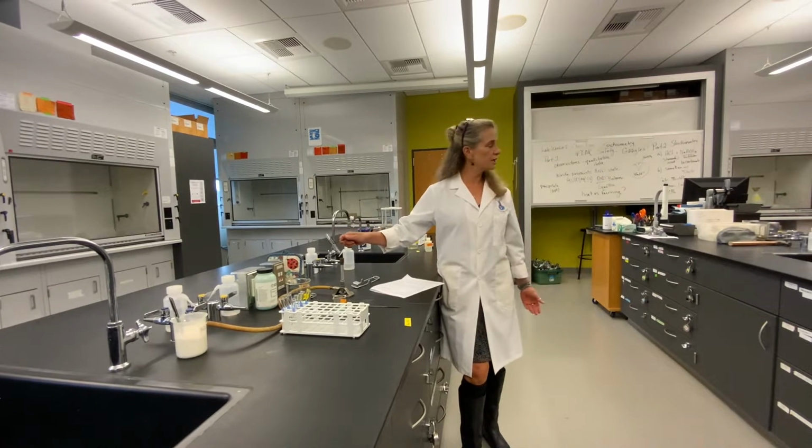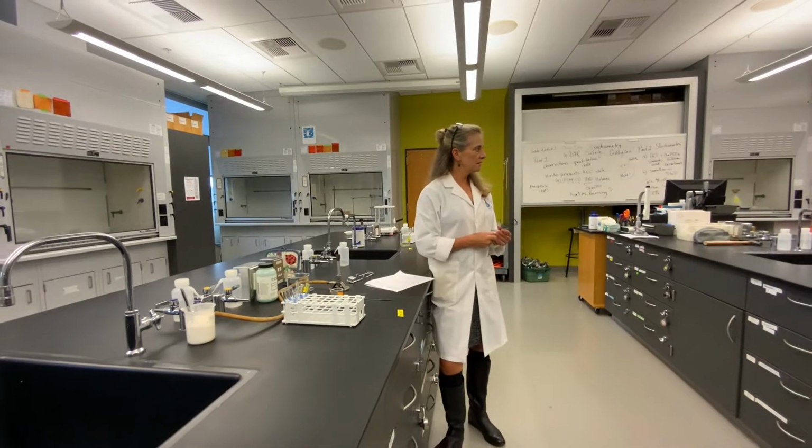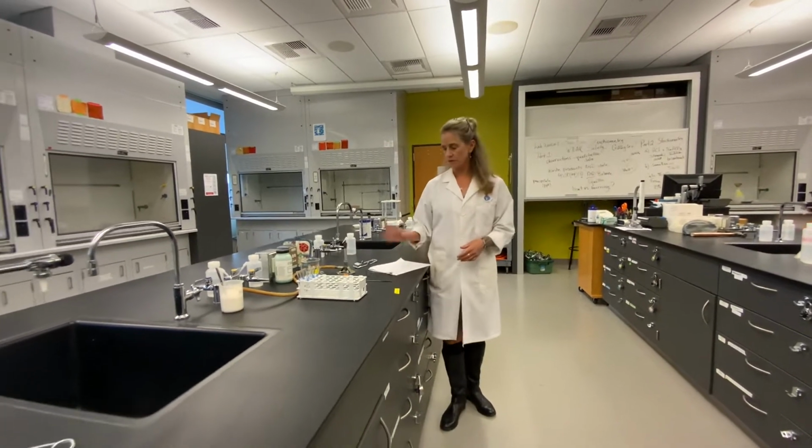You're gonna note the color change, and then the test tube can just go in the waste jar, okay? Got that? Good, okay, that's reaction number 2.